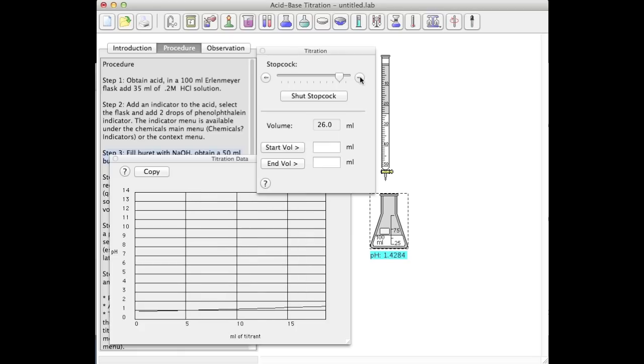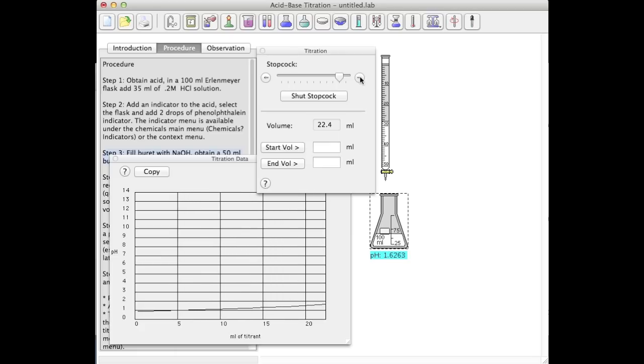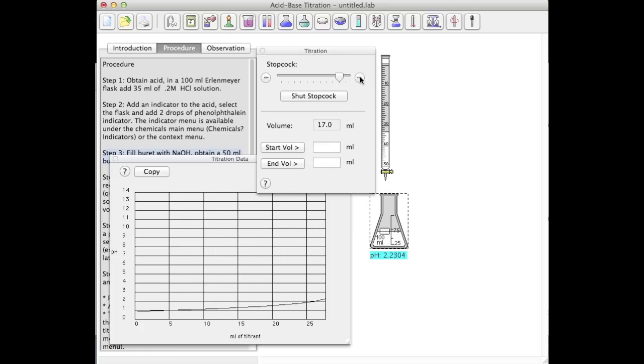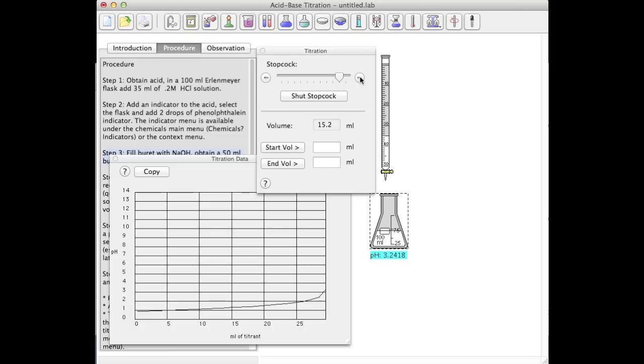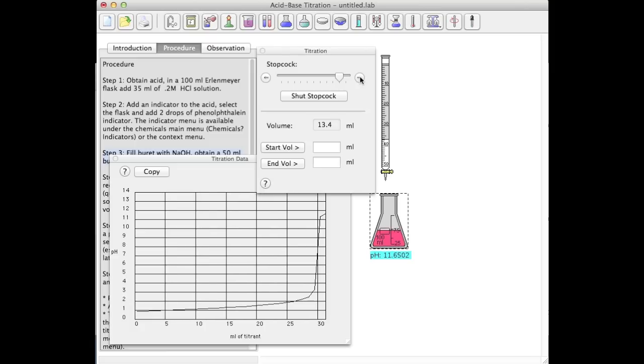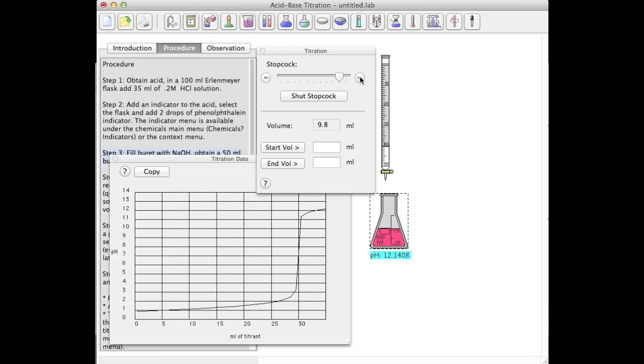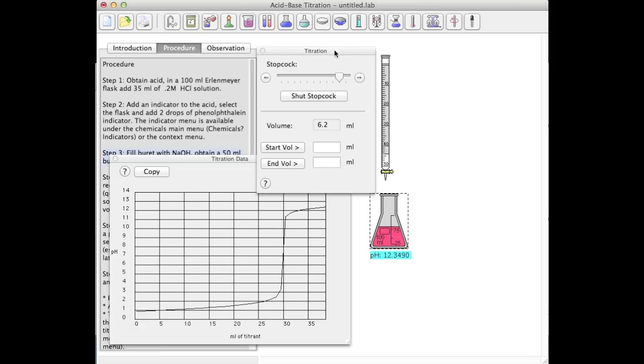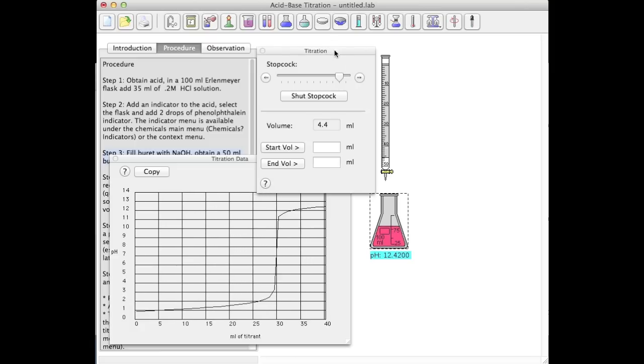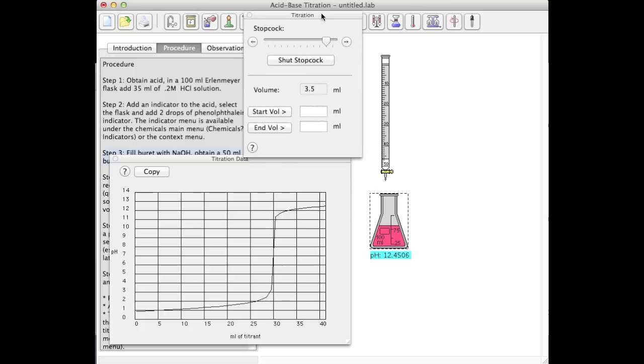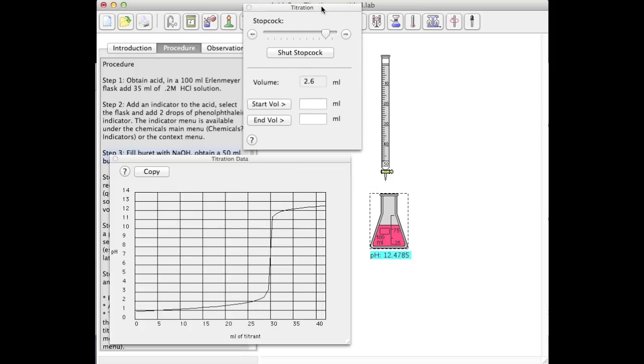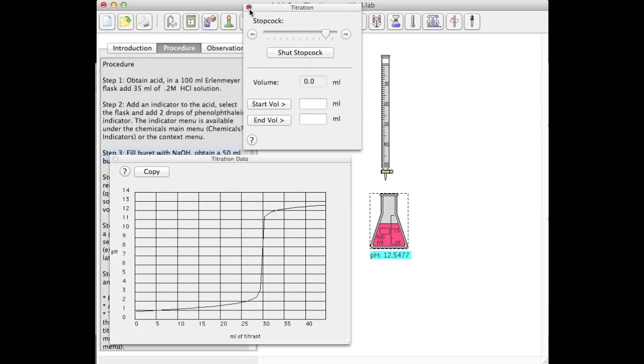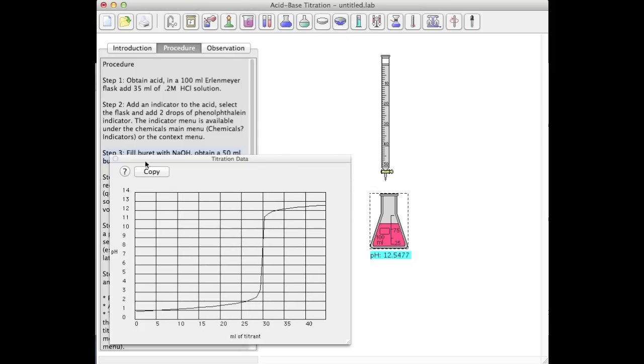I'm going to speed things up here a little bit. I'm approaching my endpoint and I have a nice color change and an endpoint. And that's a very quick acid-base titration.